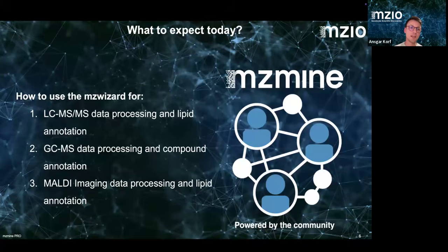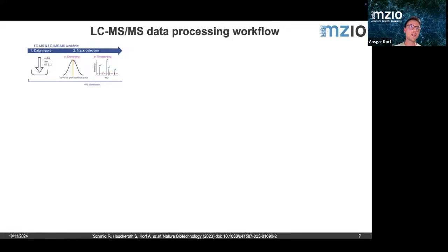So you can expect today three separate live demos: one on LC-MSMS and lipid identification, one on GC, and one on MALDI Imaging. Before we start with the LC demo, I want to briefly go through the theory behind all the data processing for LC-MSMS so that we can later easily compare it also to GC and to MALDI data processing. Okay, so for all these different data types, we always start with the raw data.